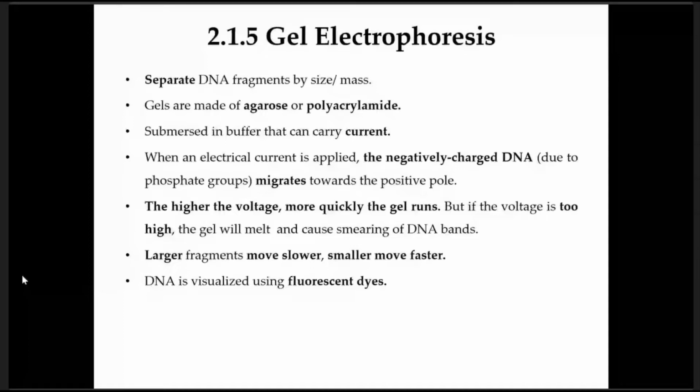The sample that you collected and isolated the DNA or the genetic material may be low in amount. So you can increase the amount of DNA that you have obtained in order for you to be able to analyze the DNA much better.